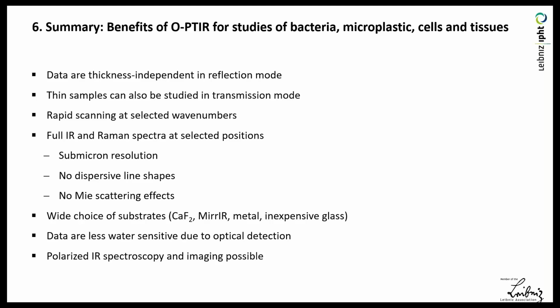It was evident that the accuracy was in the 80% range. Then we tried to focus on the separation of, for example, leukemia versus non-leukemia cells, and we were also surprised that we could distinguish the different cancer cell lines very well.